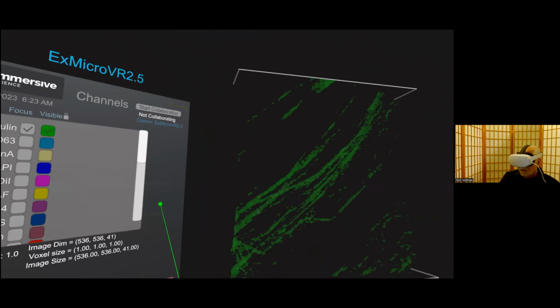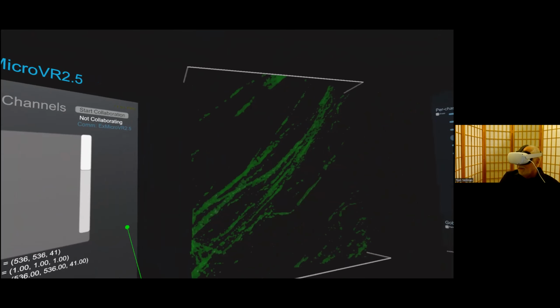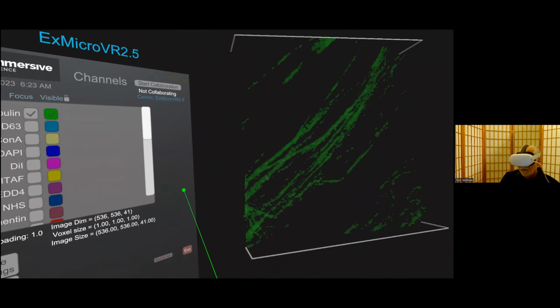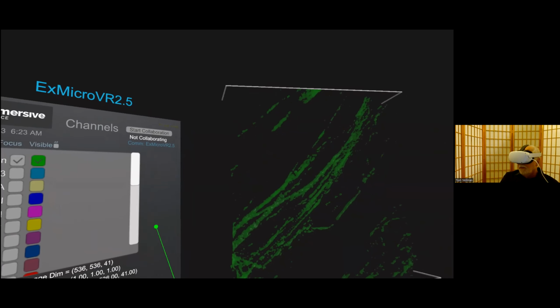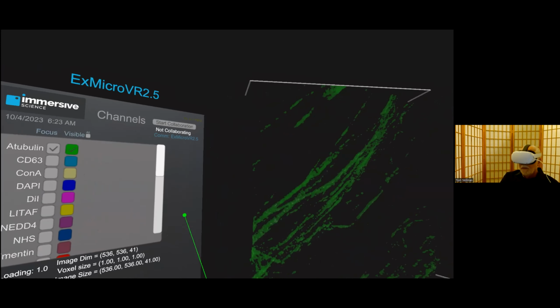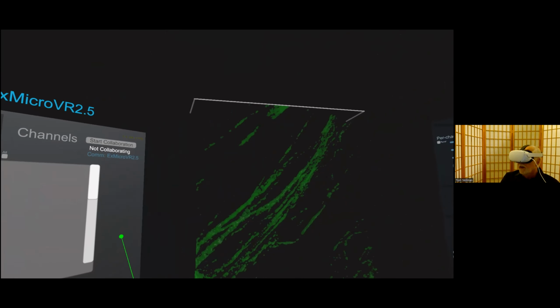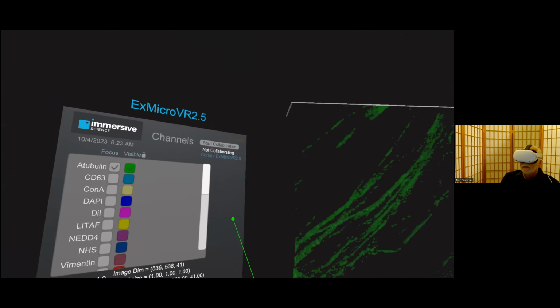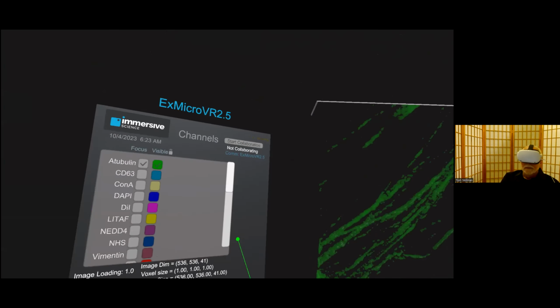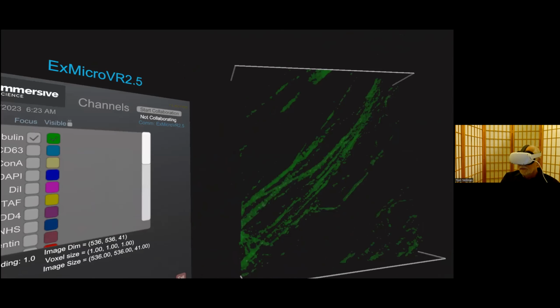She's mainly focused on microbial cell optimized next-gen expansion microscopy. So we call this micromagnify, and she discovered a way to perform expansion microscopy on a broad spectrum of pathogen-containing specimen, not just pathogen alone, but also infected tissues, including the clinical format, for example, like FFPE or H&E slice. So it has probably the most versatile version of expansion microscopy.